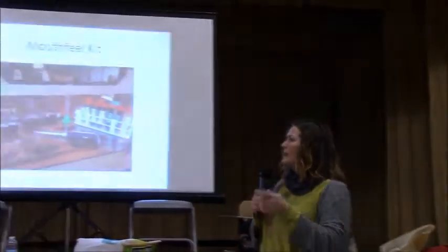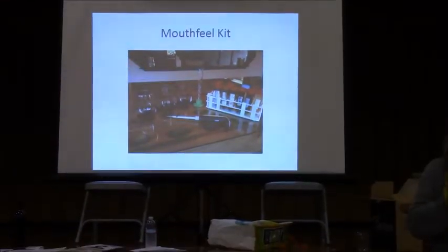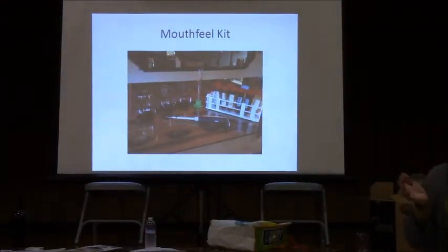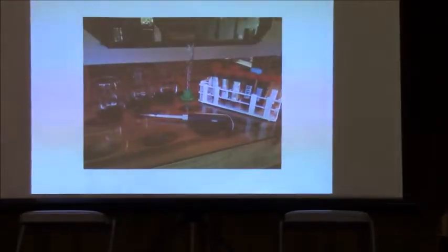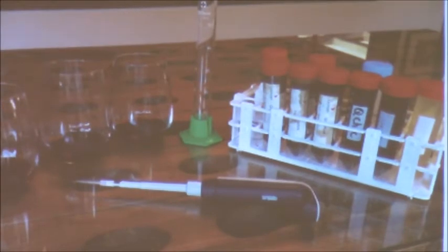Putting a kit together is really easy. I have my kit set out over there. For basically $350, you can put together your micropipettes, which are really important to do these trials. They measure out very small volumes from like 10 microliters to 100 microliters.